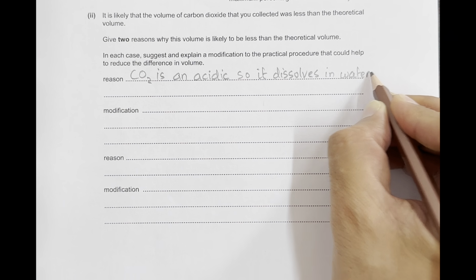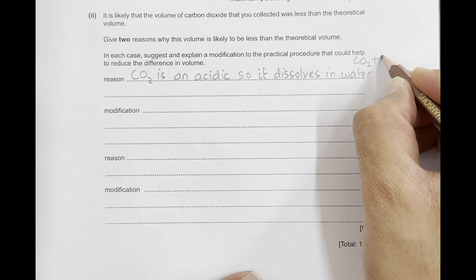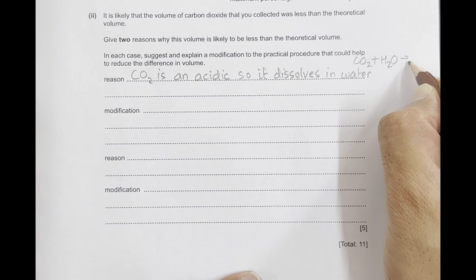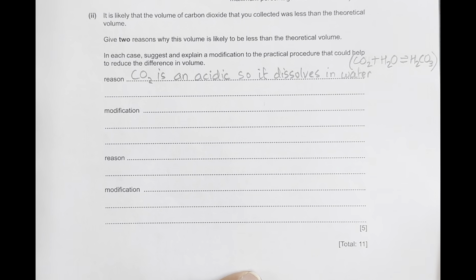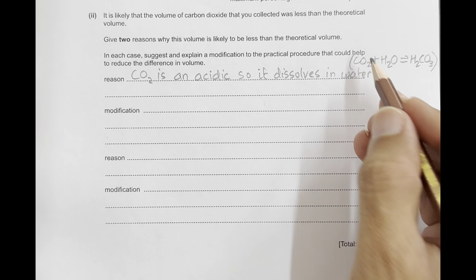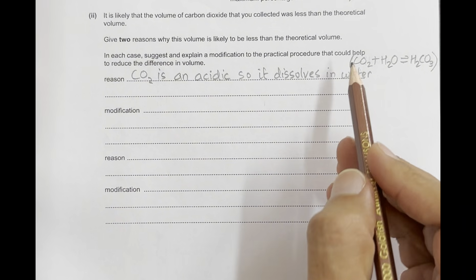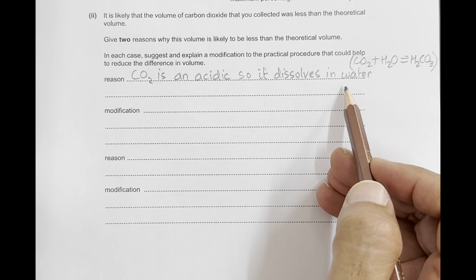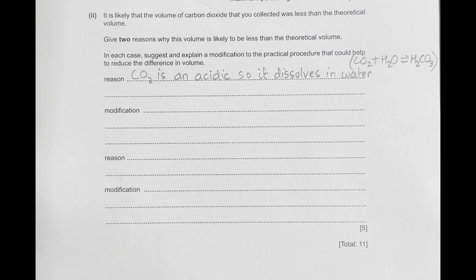And for your understanding, carbon dioxide, when dissolved in water, forms a weak acid, H2CO3, carbonic acid. Therefore, rain is usually acid rain because air contains carbon dioxide. So rainwater dissolves it and forms acid rain. Now, if it is dissolving in water and we have used a method where the gas was collected by displacing water, it means it was gradually and slowly reacting with water also.